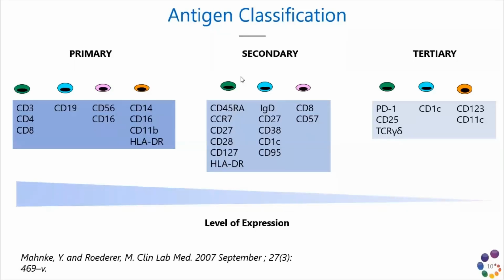Last but not least, the tertiary level are the antigens with low levels of expression or a very low frequency of occurrence, and hence they can be the most difficult to detect. So we want to make very smart choices when deciding which fluorochromes to pair with each of our tertiary antigens to ensure we can clearly resolve them in our multicolor tube.